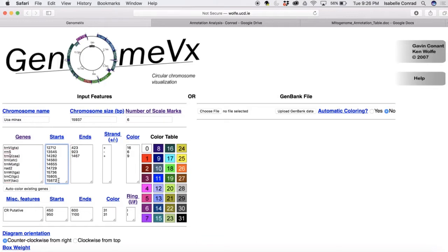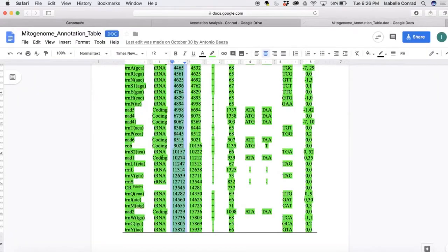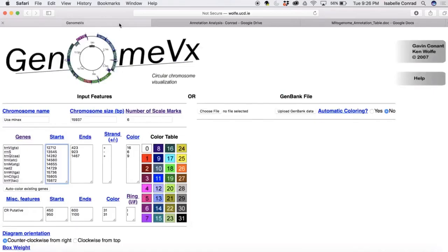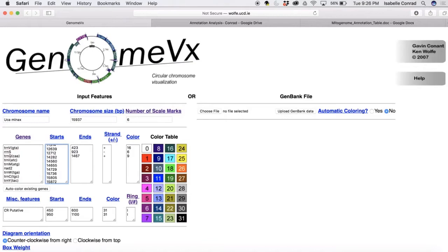But we have to remember to delete the control region start. So we're going to go find the number for that in the annotation table. It's right there. And we're going to look for it in the column and delete it. So delete the 13,545.